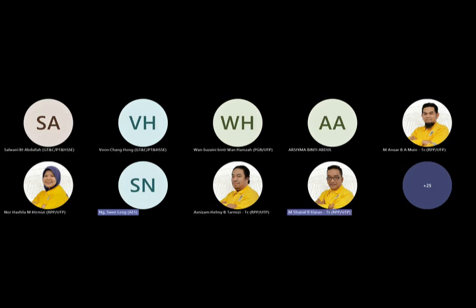They overlap each other more. Even in MS there are such problems, maybe some overlap issues, but in ICP-OES the problem is much more chaotic. So rare earth must use ICP-MS. Hope that answers Dr. Nozatushima's question.